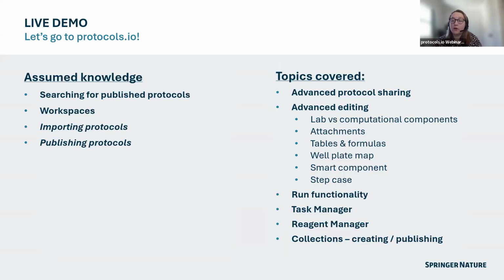So a lot of today's webinar is advanced and will be really working through the platform. As I said, there's some assumed knowledge here that you know how to search protocols.io, you know a bit about workspaces, you know about importing protocols and publishing protocols. If you don't know that, you can always go back and look at our other webinars or our tutorials or ask any questions toward the end. For today, I'll largely be covering protocol sharing, editing, run functionality, the task and reagent managers, and collections.